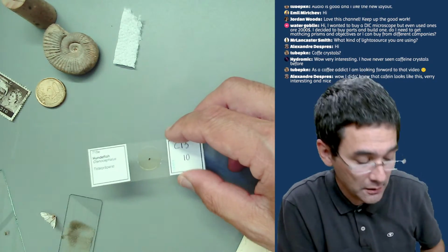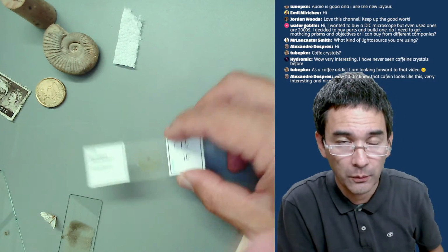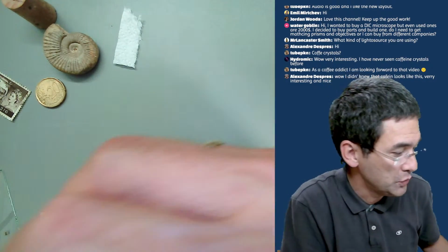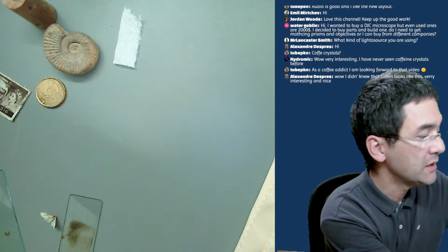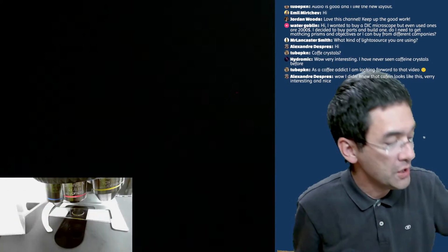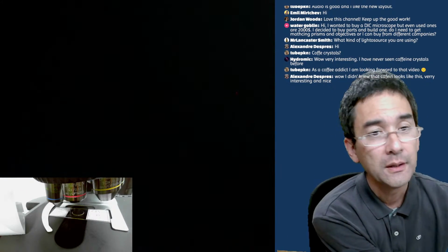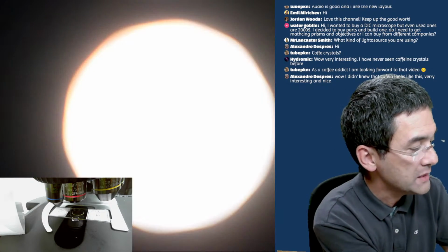It's a commercial slide, and I'm going to show you now how it looks with light coming from the bottom. Just the regular appearance. So again, off. I put it in now. I'm going to switch again over to the microscope so that you see a comparison and why top illumination is not always possible.